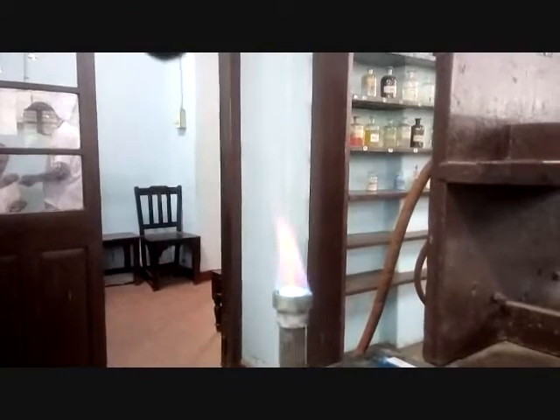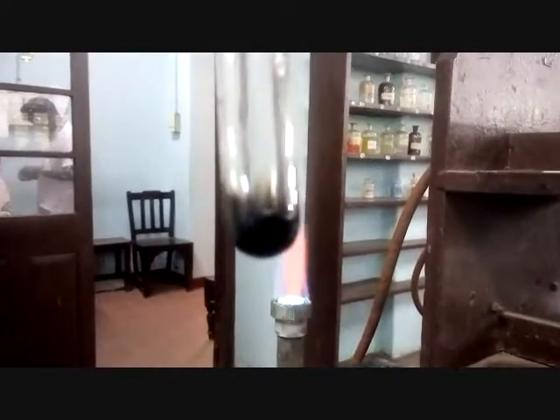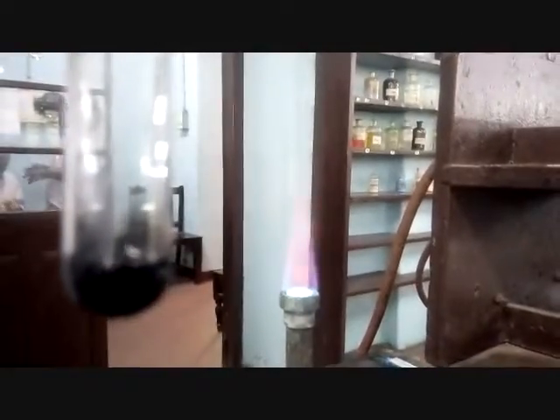Effervescence occurs along with the smell of burned sugar. The compound may be a carbohydrate.